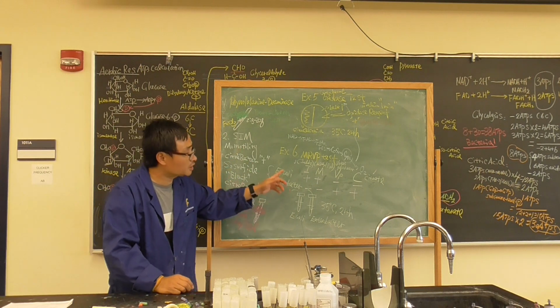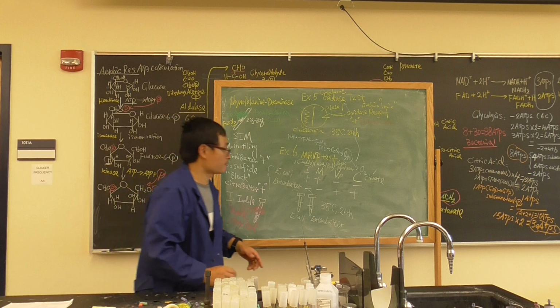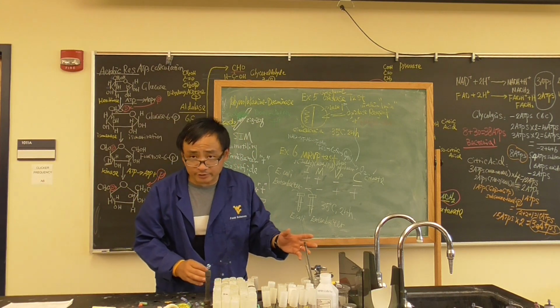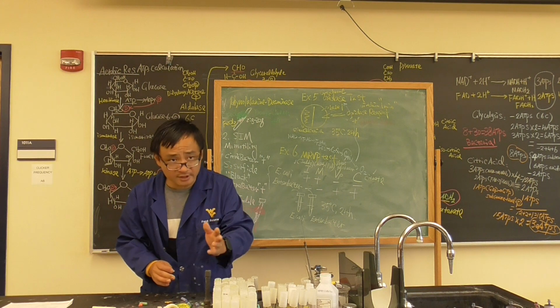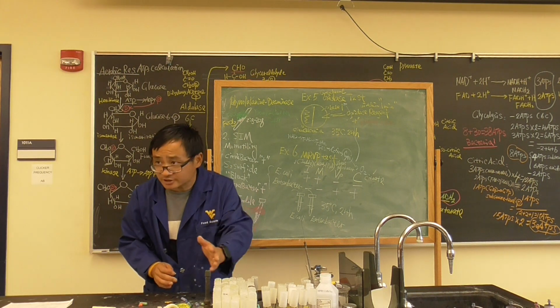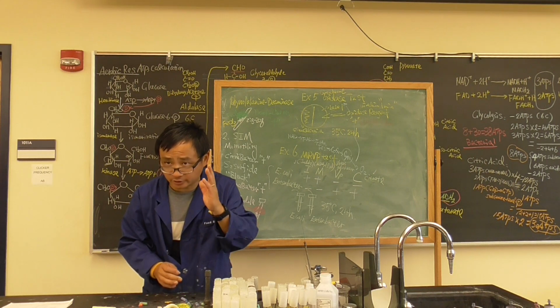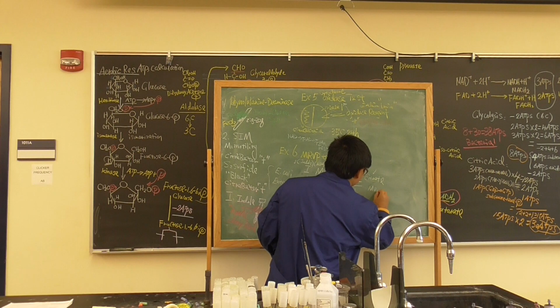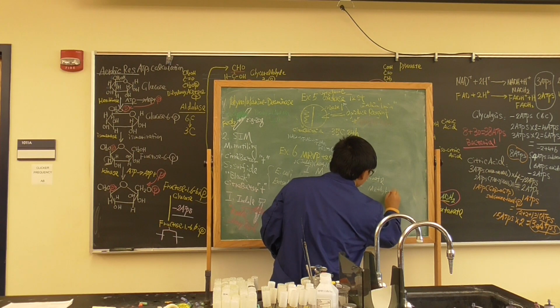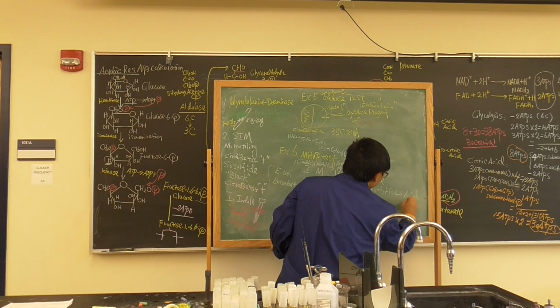Now, what is this test for? This is related to fermentation. Some of the bacteria during fermentation will directly, or we say immediately, generate acid products. That is why we use methyl red to test it. So, methyl red is to test acid products through fermentation.